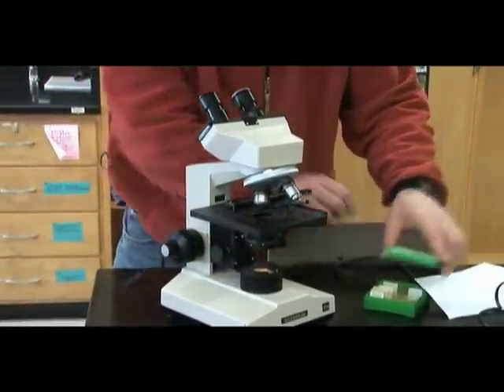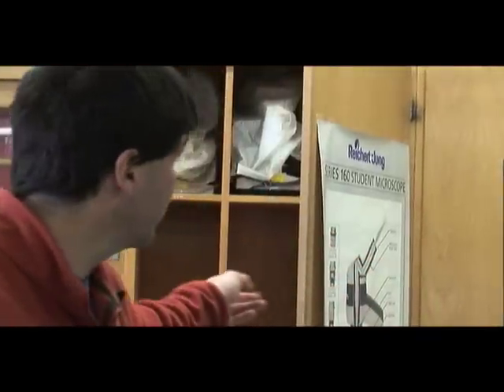Okay, that's the primer on use of the compound light microscope. The last thing I can tell you is for narrow cabinets, you've got to make sure that this adjustment is all the way in, or else it won't fit into the cabinet space.